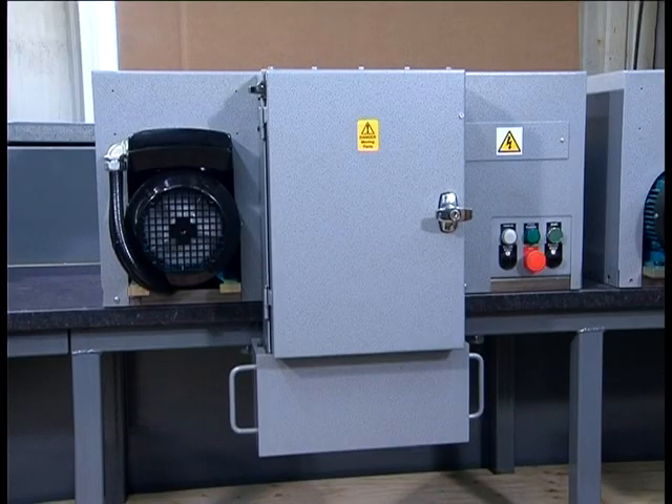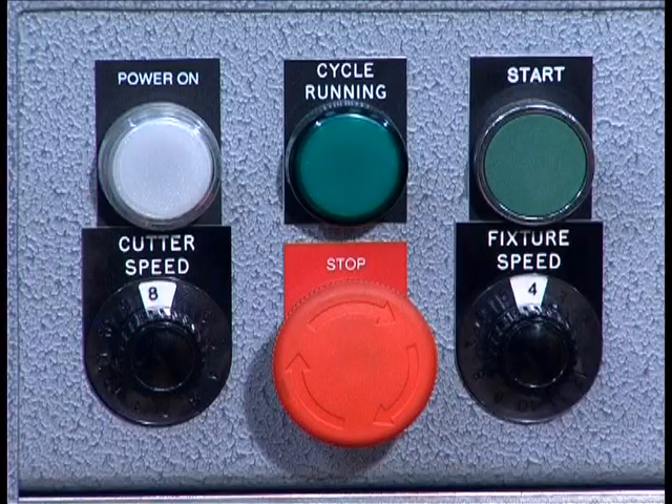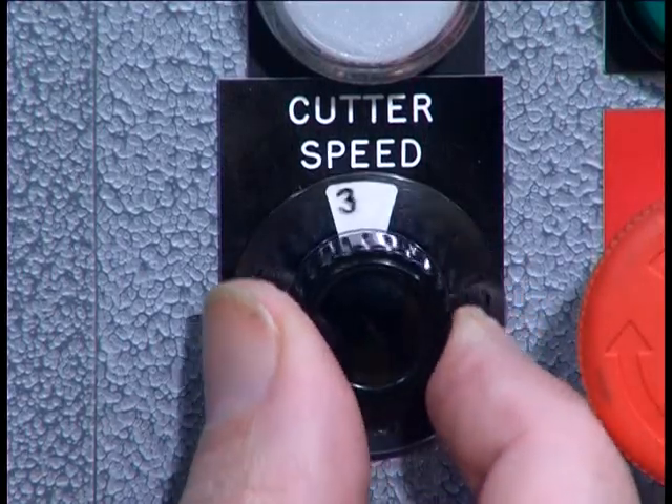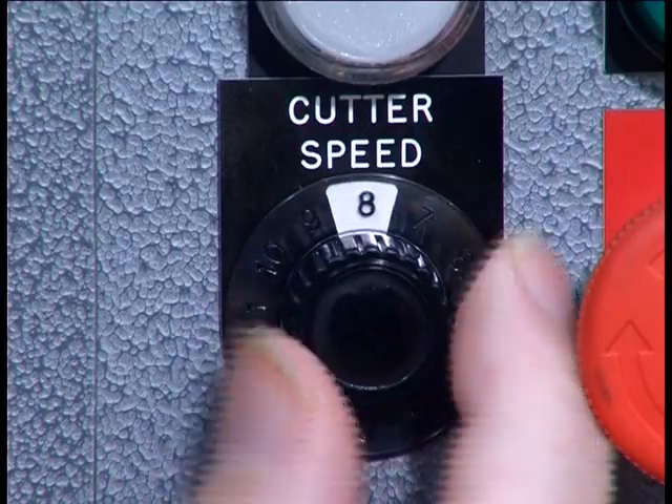Two types of machines are available: the fixed speed machine and the variable speed machine. The variable speed cutter is controlled by a variable speed motor via a thyristor.